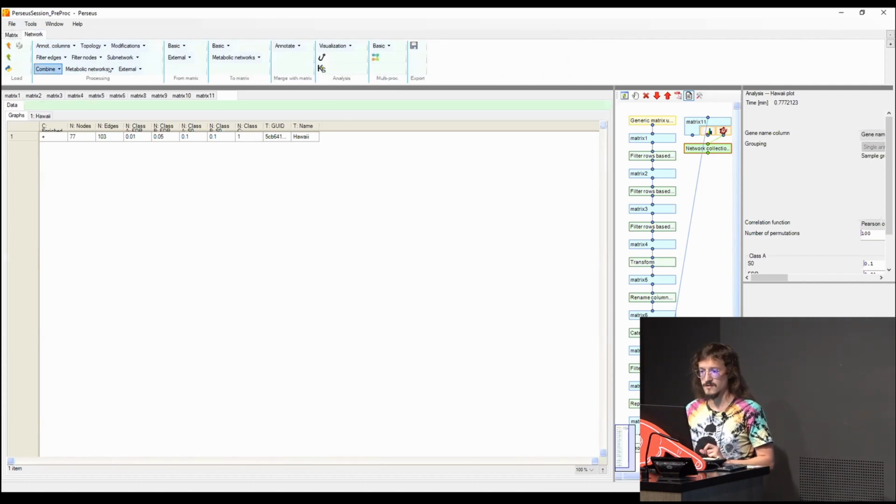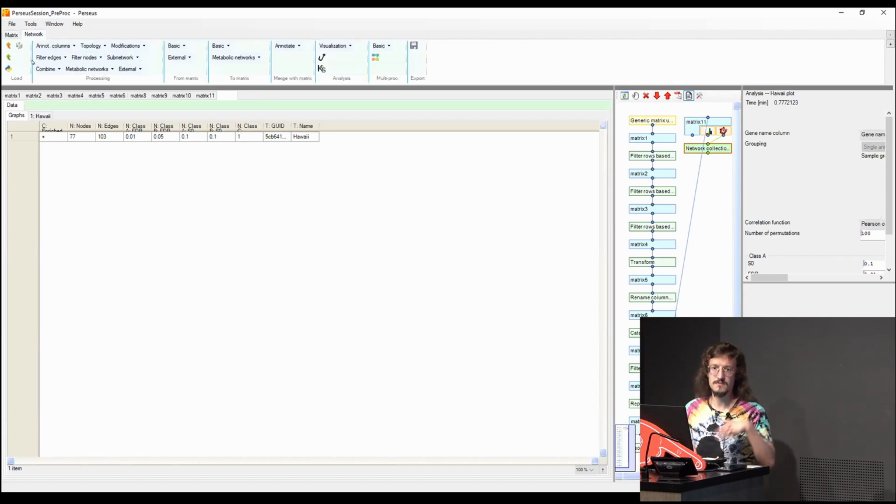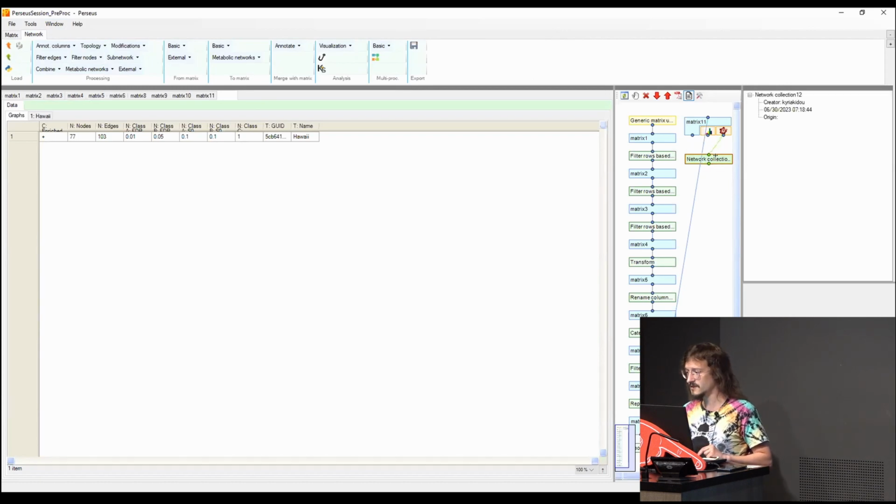Here you see everything changes because you're working with networks and you have some different functions. Again, you can do modification-specific things, you can change annotation. It's very similar, but they are specifically suited for networks. And what is a network node from Perseus? That is this one. You see it's green. You can recognize it also from the color and from the fact that it's called network.